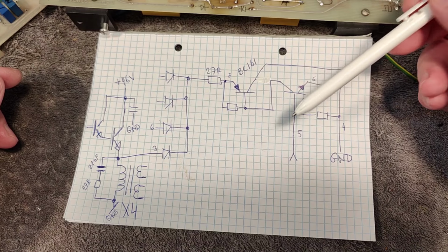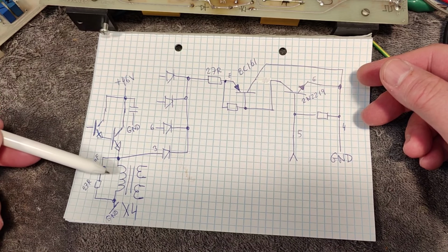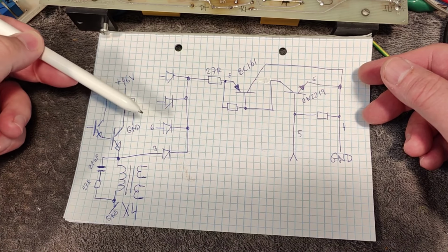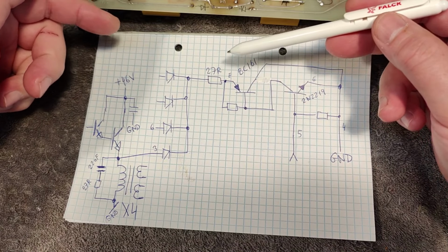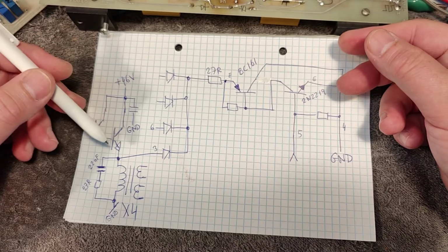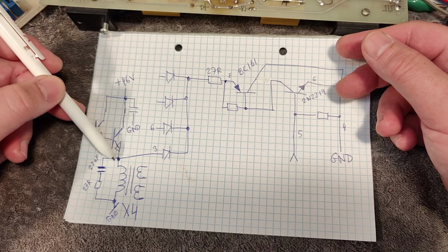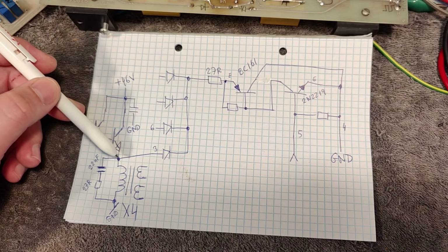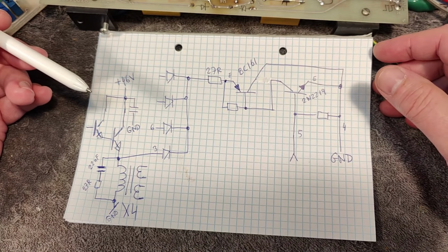So there's an active clamp circuit for the flyback converter. It activates this inductor, charges the inductor, and when it releases the power, then it flies back, and then it clamps the signal so it's not flying way too high, but it's clamping it down to ground. And this is a little bit special. I would have made it so it clamps it to 46 volts and not to ground, but this way the current can flow around and not just be killed to ground. So it's a little bit weird the way that they made this circuit, I must say. Everything here is just weird and special.